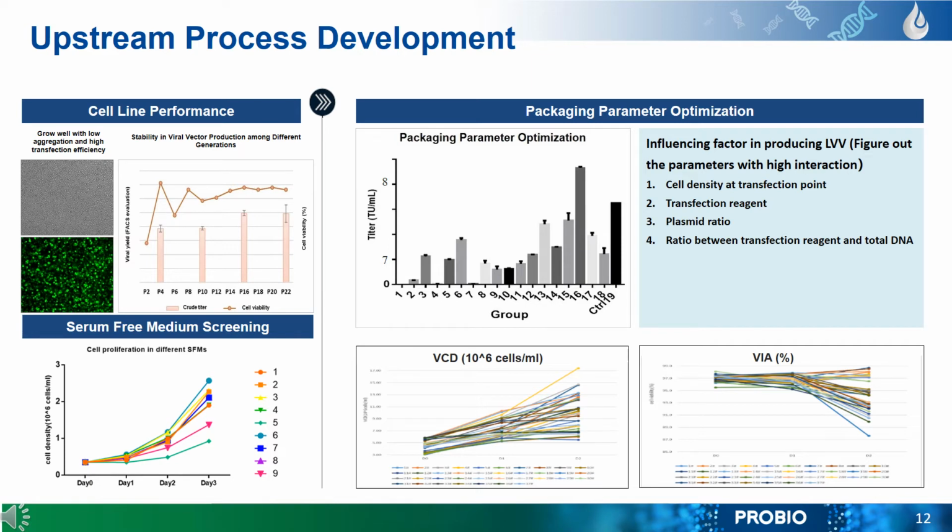There is an increasing demand for biopharmaceuticals produced from animal cell culture processes. To optimize large-scale clinical-grade lentiviral vector production, we developed an improved production scheme by adapting HEK293T cells to grow in suspension using commercially available serum-free medium. We have successfully selected a monoclonal HEK293T cell, which is adapted for robust growth in suspension culture using a serum-free medium. This cell line is named PowerS293T. Our PowerS293T has stably produced lentivirus over 22 passages.